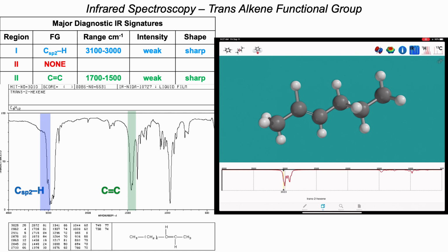So let's go ahead and watch this movie. Again, you see overlap between the different stretching modes. That's why you see these other bonds stretching. And again, if you think about the uniqueness of the hydrogen sets, that's why you see a lot of different peaks in that region, because they're all going to have their different vibrational modes. So let's move on.